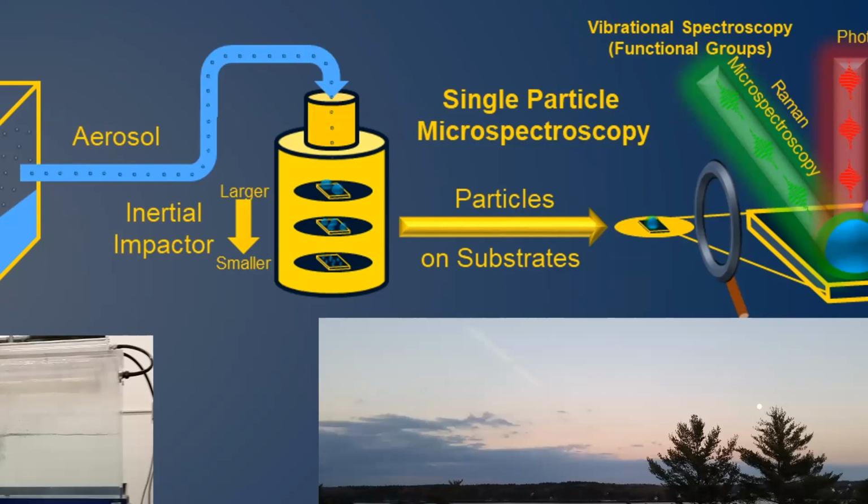What we wanted to understand, for this coastal environment where you have lakes and rivers that are freshwater feeding into this bay, was what the organic composition of aerosol emitted from that would be. These marine aerosol reference tanks that I'm showing in the lower left here have been validated by folks at Scripps Institution of Oceanography and are commercially sold, very well characterized. And we said, all right, let's collect some of these particles and look at them with our Raman, but also with our new optical photothermal infrared method.